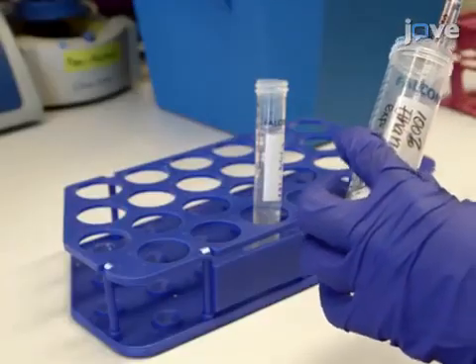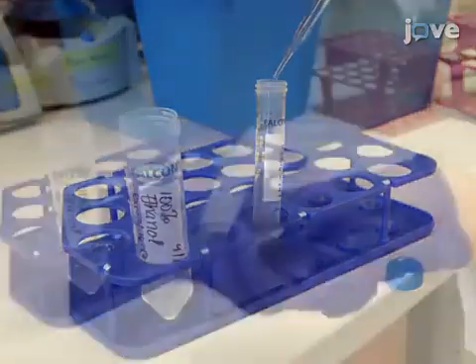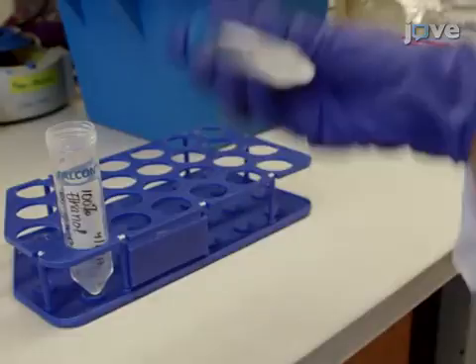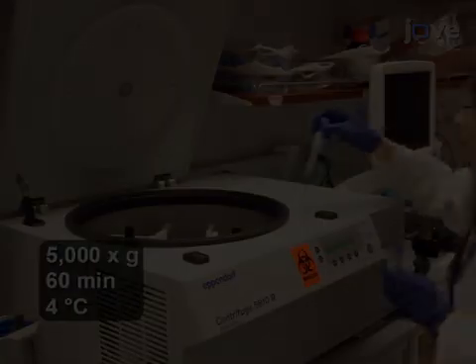Add 2 volumes of 100% ethanol and mix by inverting the tube 6 to 8 times. Centrifuge at 5,100 times G for 15 minutes at room temperature.